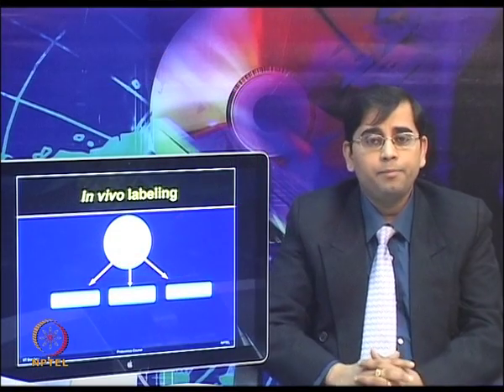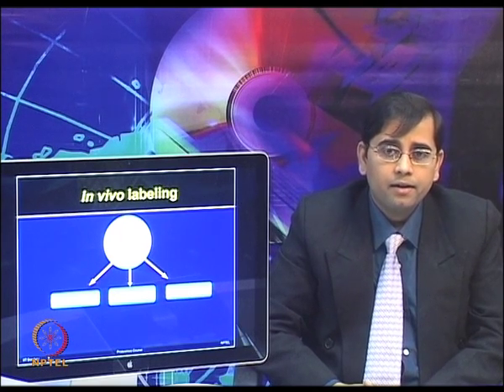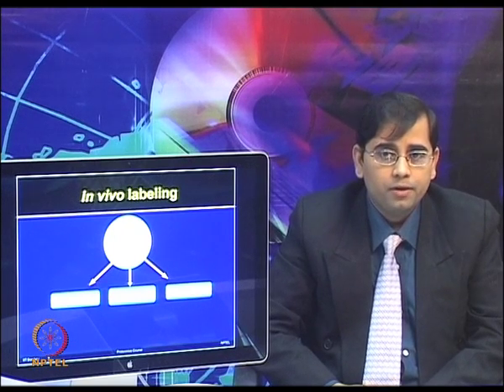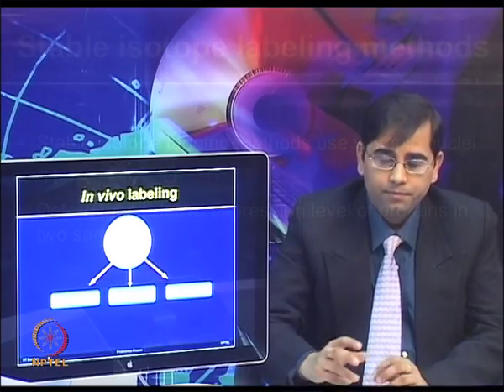We will discuss briefly the 15N media method and culture derived isotope tags, and then we will focus mainly on the SILAC method for the rest of the lecture.